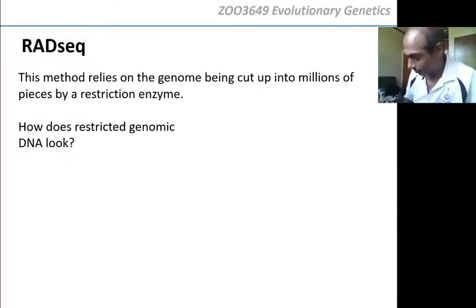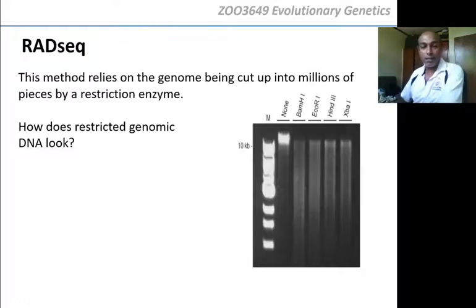You run a gel. So here is a gel. And you've learned about gels. I taught you about gels in 2544. We asked you exam questions about gels in 2544. So now, don't come and look at this gel and be confused. What do we have in this gel here? You put the DNA here, right? You applied an electric charge between this part of the gel and that part of the gel.